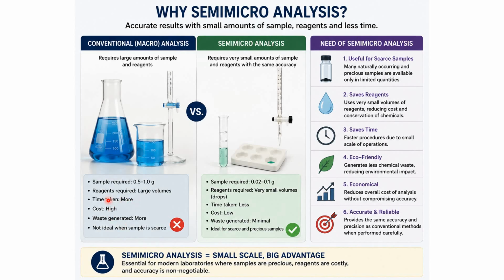Whereas in macro analysis, large volumes and large quantities are taken, so the time taken will be more, and more chemicals, reagents, and samples are required. So it is highly costly, and the waste generated also will be more, and it is not preferable for samples which are not easily available, that is, scarce samples. So semi-micro analysis is superior to macro analysis.